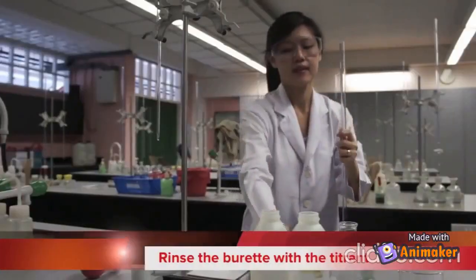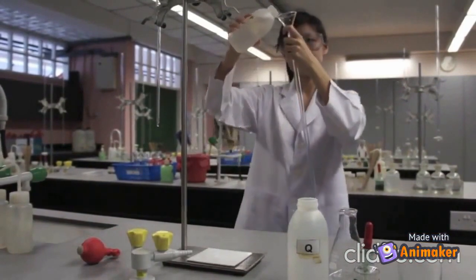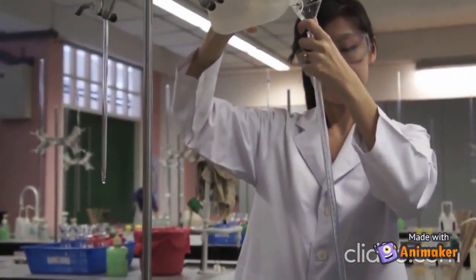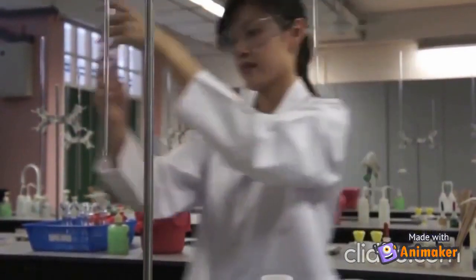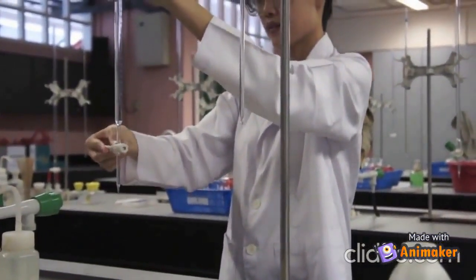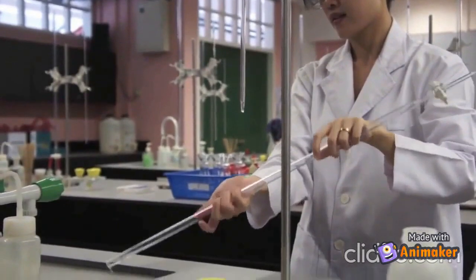The second step is to prepare the burette. Rinse the burette with the titrant, using a funnel to help you pour the solution into the burette from the top. Make sure the tap is closed at the bottom or you'll have a puddle on the floor. Fill only a third of the burette, and open the tap to wash the tip of the burette just like you did with water. Pour the rest of the solution out from the top of the burette, cleaning all of the inside of the burette as you do so.